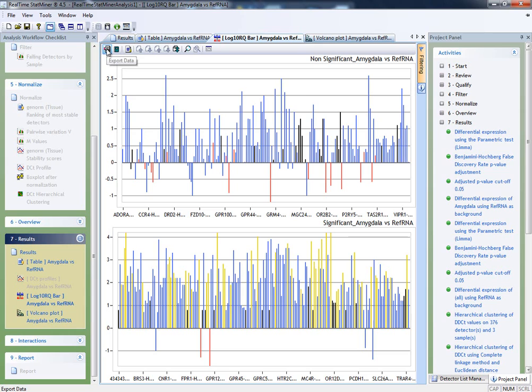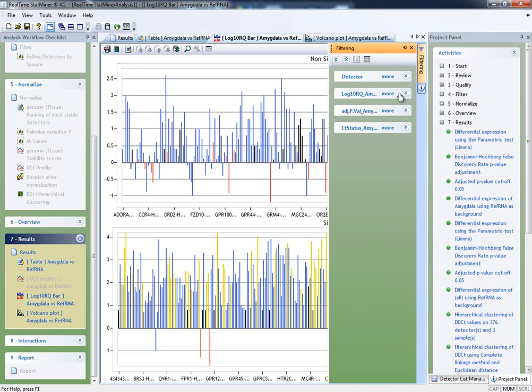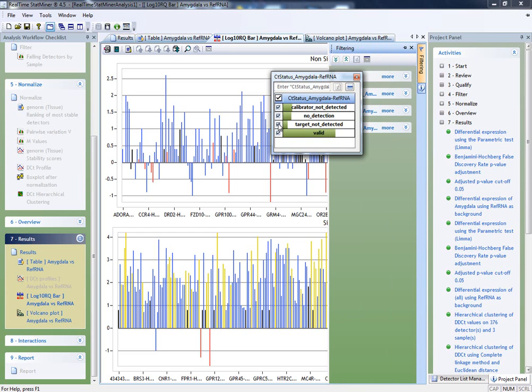There are two ways by which StatMiner can report the analysis information. Firstly, by exporting one by one each data table or visualization to a well-known format such as a picture, Excel file, etc. Secondly, by generating a full report including a set of data table and charts properly organized by sections in an exported format such as an Excel file, PowerPoint, etc.